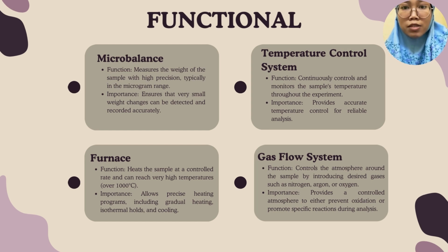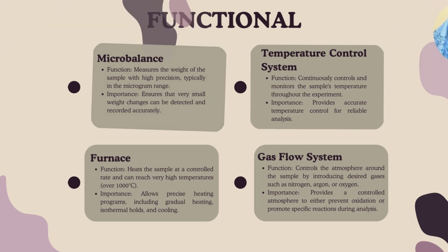And the last one is the gas flow system. The function is to control the atmosphere around the sample by introducing desired gases such as nitrogen, argon or oxygen. The importance is to provide a controlled atmosphere to either prevent oxidation or promote a specific reaction during analysis.